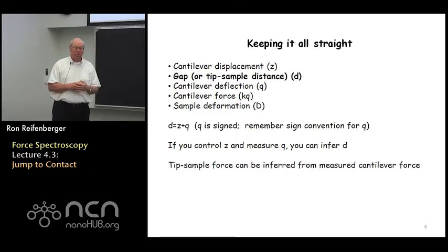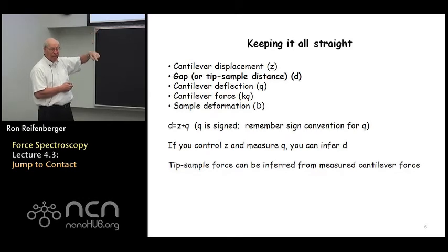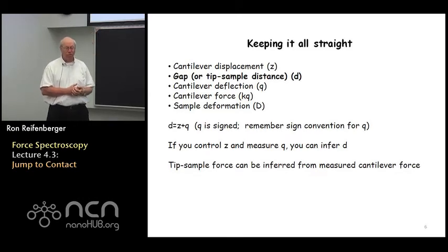And of course the tip-sample force, that's the thing that's fundamentally interesting. That has to be inferred from the measured cantilever force. And the cantilever force is always given by the spring constant K times the deflection of the cantilever Q. So maybe this slide is useful because it tries to lay out all these things in a systematic way.